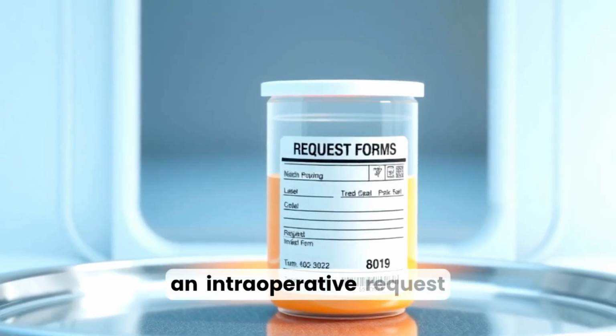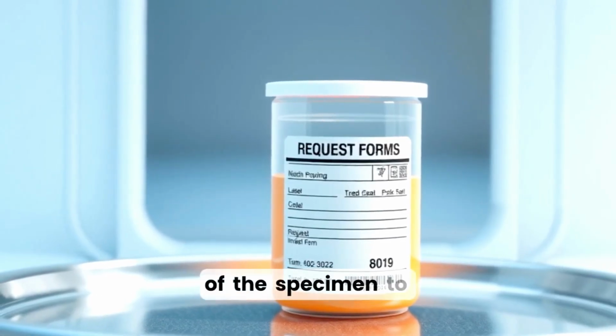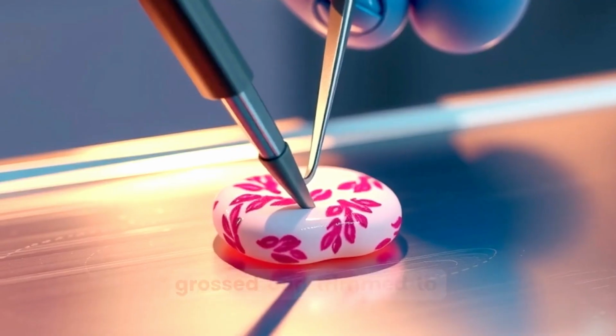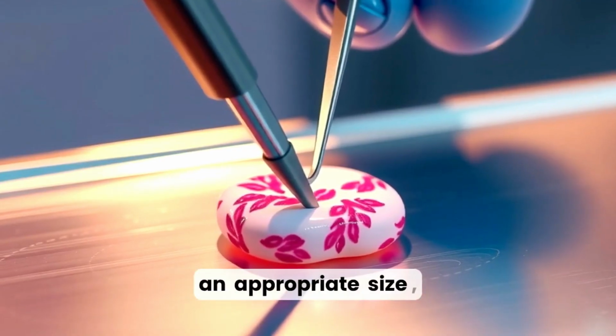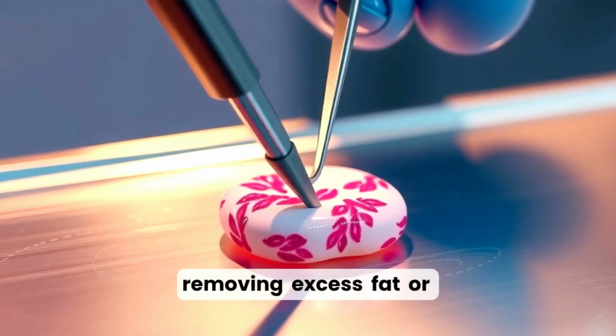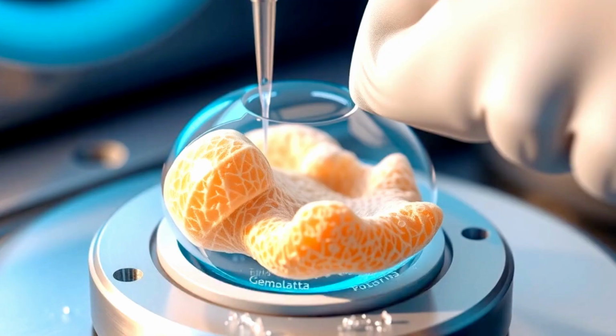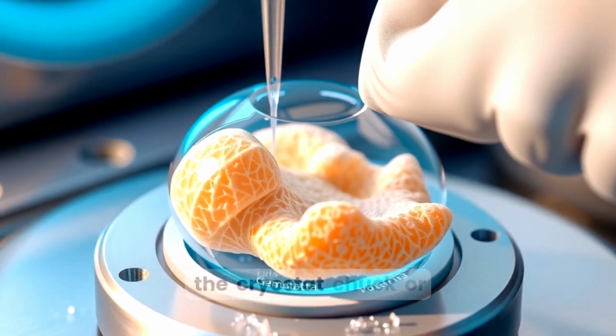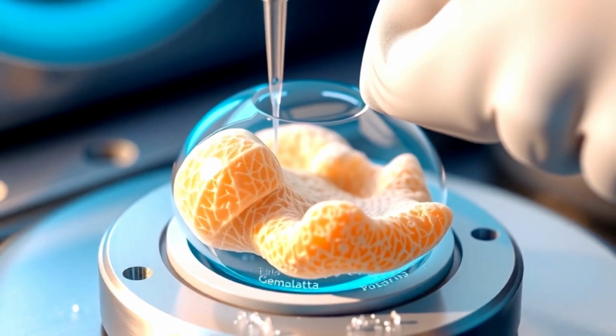Step 1 begins with an intraoperative request and correct labeling of the specimen to ensure accurate reporting. Next, the specimen is grossed and trimmed to an appropriate size, removing excess fat or tissue that impedes freezing. The trimmed tissue is embedded in OCT compound and rapidly frozen on the cryostat chuck or a cold plate.